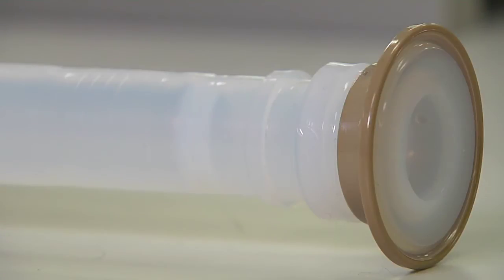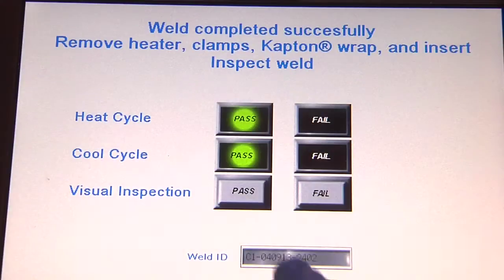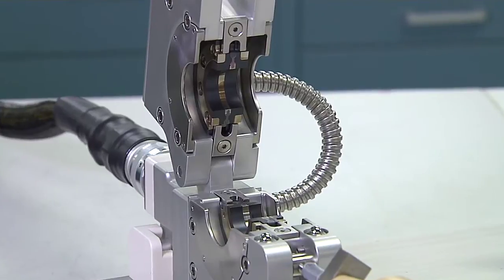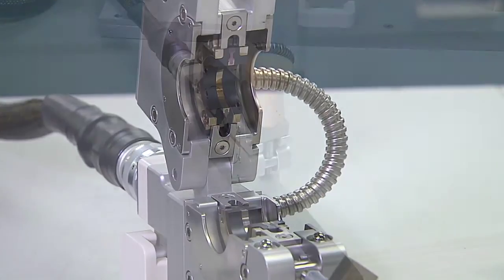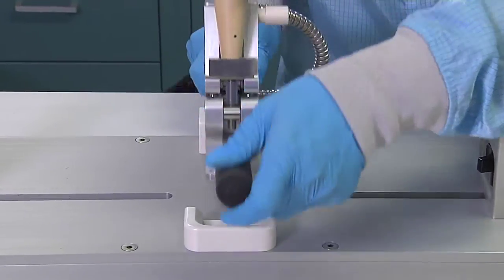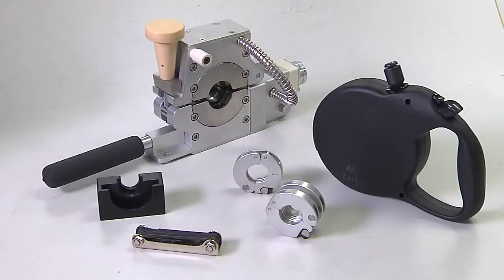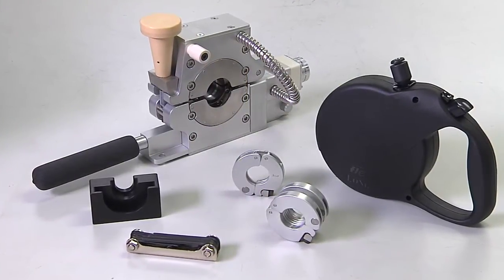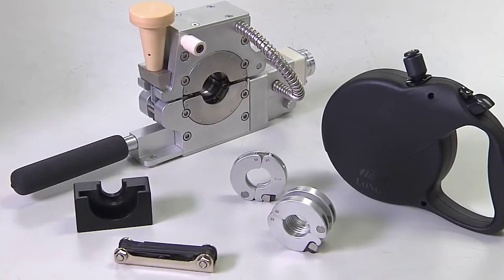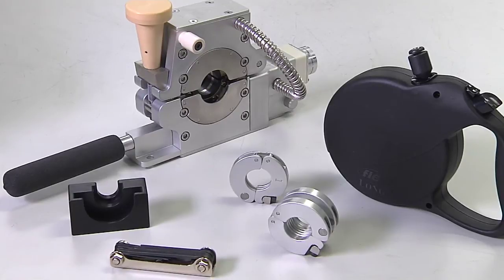The technology provides precise welds and automated weld validation data. The portable weld head accommodates welding in remote, hard-to-access areas, or it can be coupled with the bench-mount base when welding sub-assemblies. Additionally, weld kits for various half-inch to two-inch sized systems include the tools and accessories to perform a beadless PFA weld.